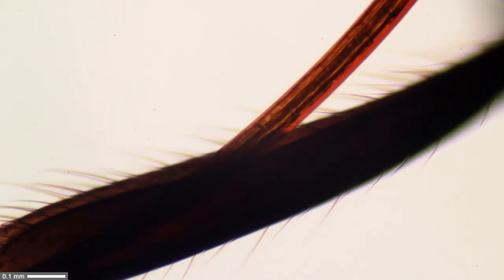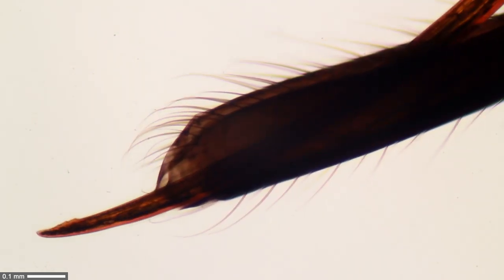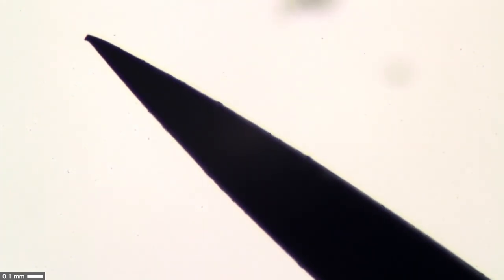The exoskeleton of the insect is quite dark, so unfortunately I do not see many more details. It's just a large black shadowy structure. Chemical treatment could brighten up the exoskeleton quite a bit. What is this? Well, that is the needle now at the same magnification. We can see it is significantly thicker than the stinger. It's made of metal, therefore equally intransparent to light, and it's by far not as sharp and pointed as one of those stingers of the wasp. Quite remarkable.